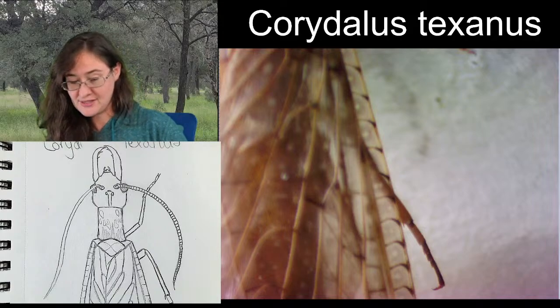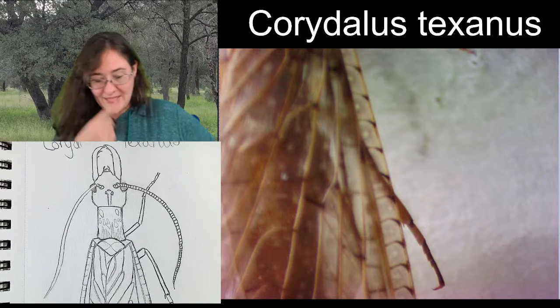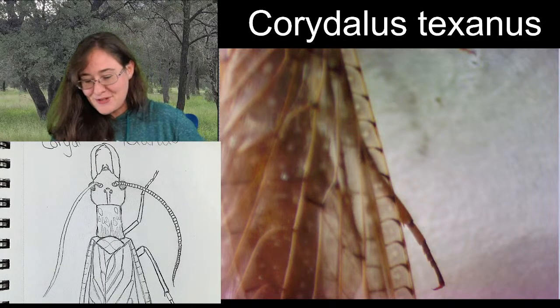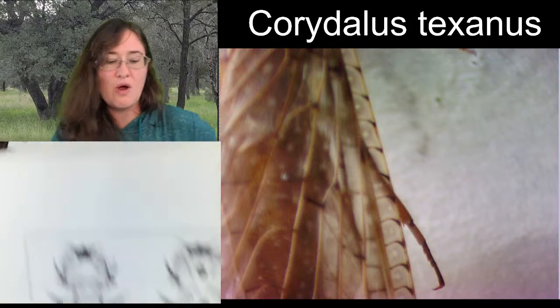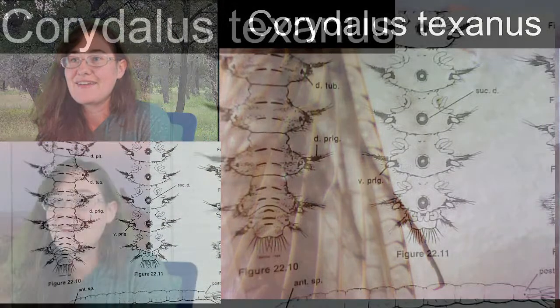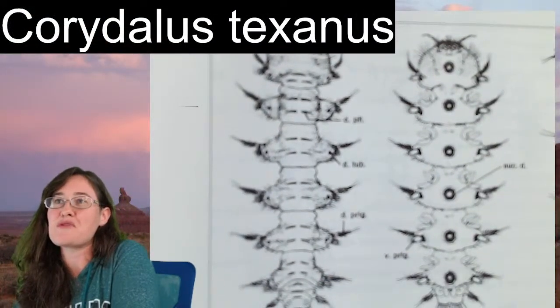There's dipterans. Alright. Oh, these are my favorite dipteran. I'm going to show them to you, even though this isn't what we were talking about, because I just saw it. Here, let's go on a little aquatics rant for a moment.